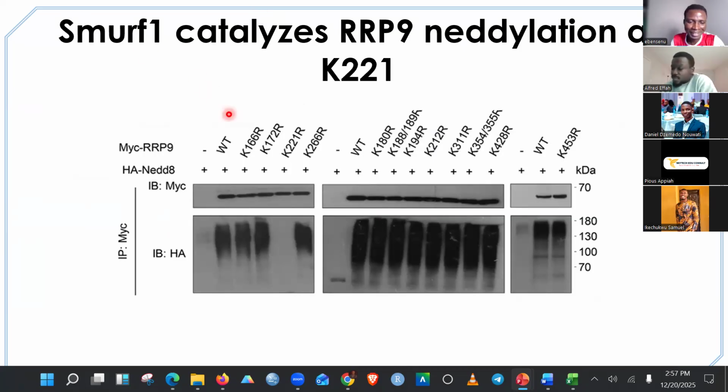In this slide, the mutation they did was the conversion of lysine to arginine. Why do you think they changed the lysine amino acid to arginine, and not any other amino acid?